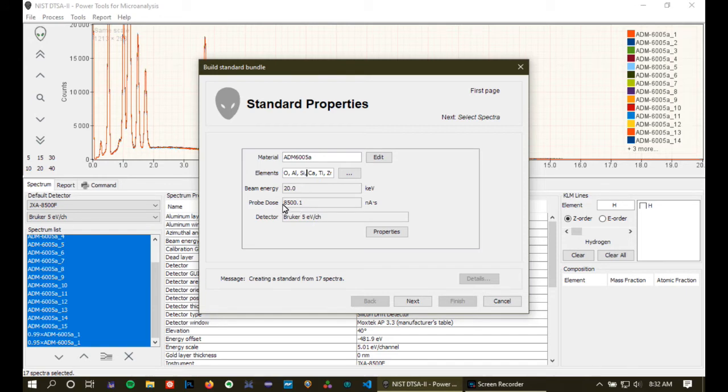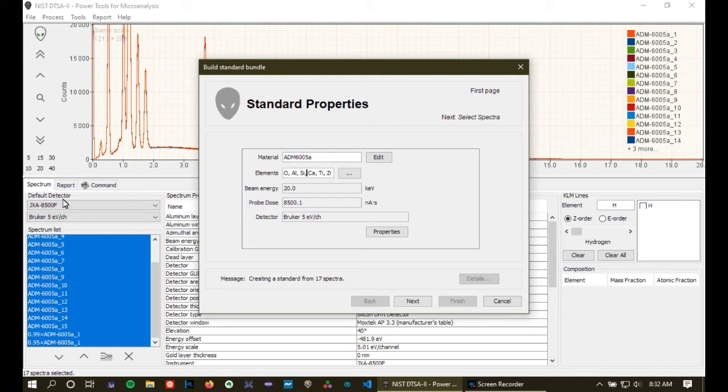This information is being read out from inside the files. This is the probe dose associated with all 17 spectra. This is the beam energy and the detector. The detector is this default detector that you see over here. All right, so that all looks good.